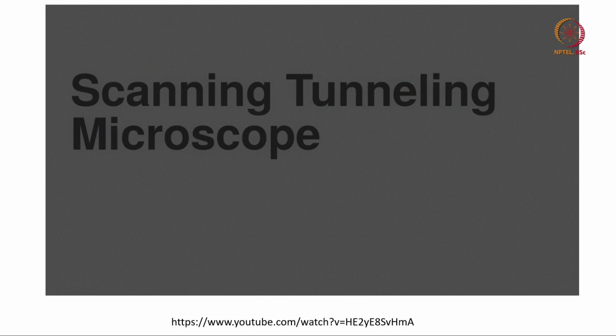We can even see blood cells, we can see materials like graphite, and we can analyze different kinds of materials. This is a YouTube video, so I will not play it because it is already on YouTube. You can just copy this link and play it on YouTube. You can search for STM, it is very simple.